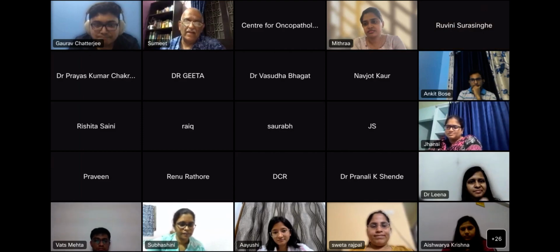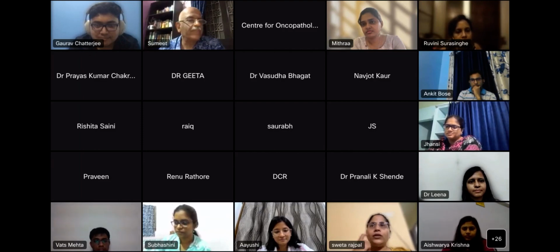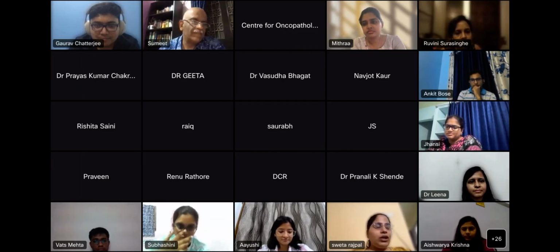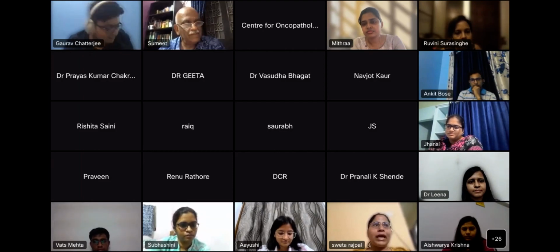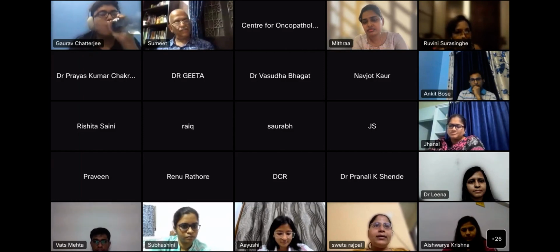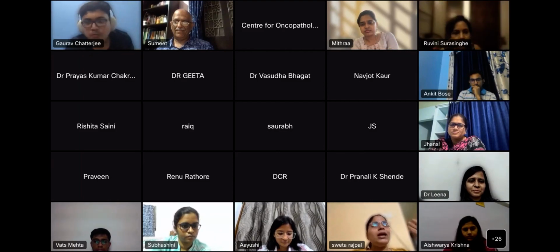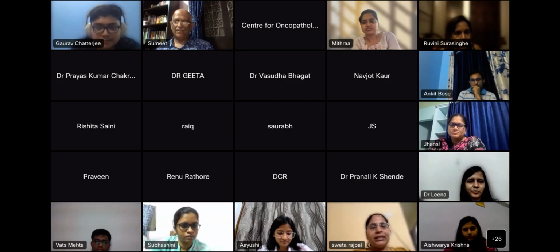Any questions or comments? Shweta, you want to say anything? Yeah. In flow also, while observing, you have to look at the normal parts also. Why are we calling anything abnormal? And is everything else normal? Just finding one abnormality, we should not be happy that okay, this is the abnormality. We should look at every component and try to see if everything else is normal or not. That is also important. Absolutely.